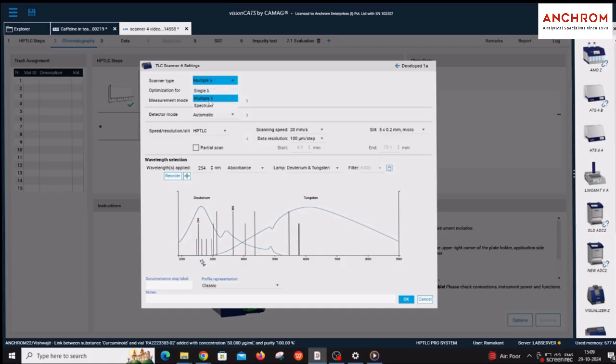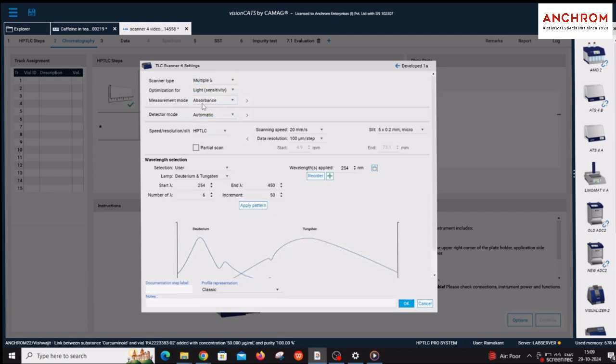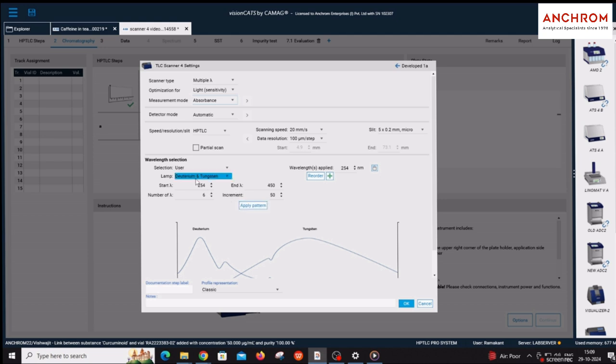For multiple wavelength scanning, select multiple lambda under scanner type. By selecting absorbance in the measurement mode, you can apply for scanning in multiple wavelengths from start lambda to end lambda in multiple increments for UV-visible range.